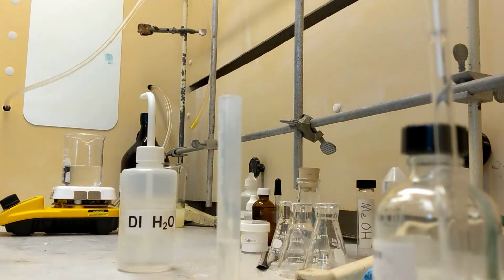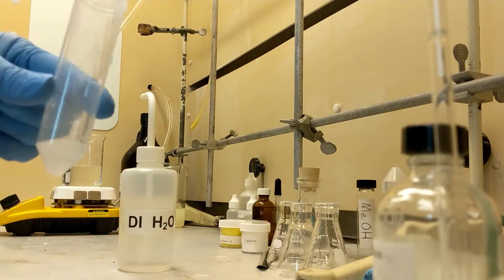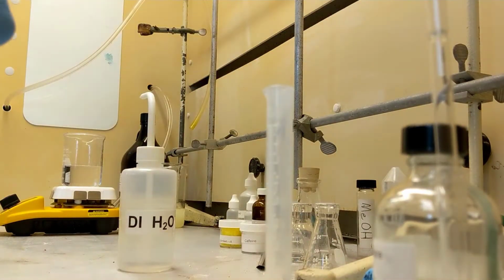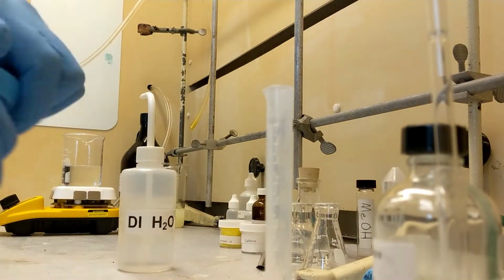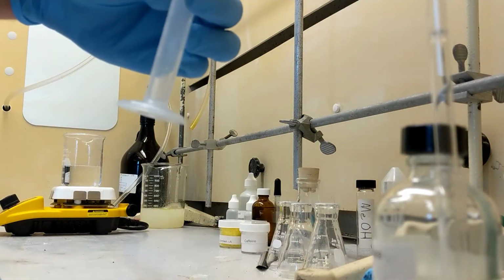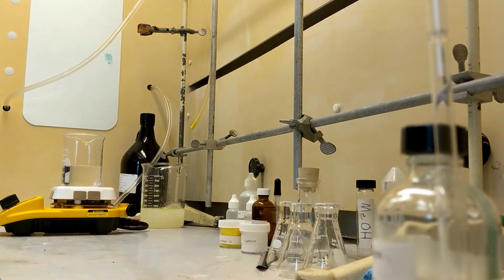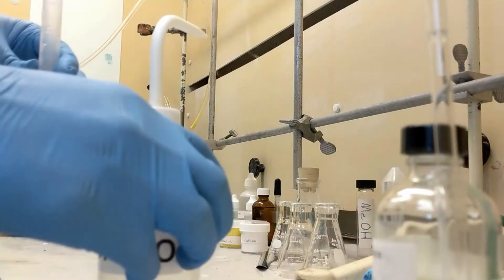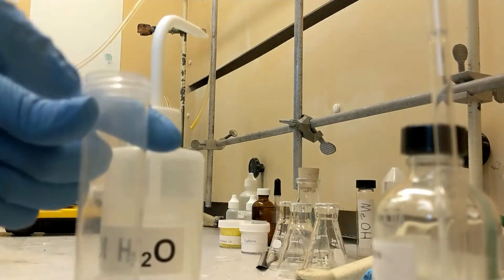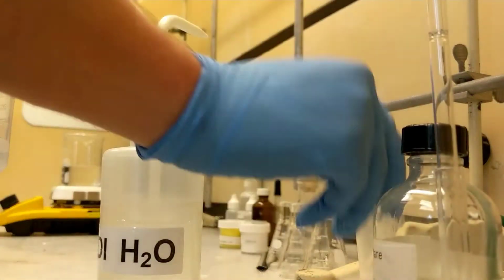Dichloromethane. Just going to add that in there. Oops. Okay, set that down, and then 4 milliliters of water. Since these are going in the same tube, I don't feel extremely bad about it. Then rinsing this out immediately after. 4 milliliters of water added right there on top. Boom. I'm going to rinse that out.